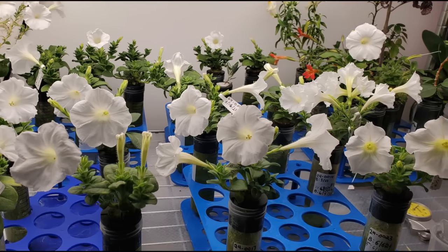So when it smacks that mesh, the particles then continue, because it's in a vacuum, down at the speed of the disc onto the tissue. So it literally shoots the particles into the cells. And then through black magic that we don't really understand, the DNA gets integrated into the plant genome. Right? Wow. Yeah. And so you're basically causing a stress shock wave that upregulates the machinery for genetic repair.